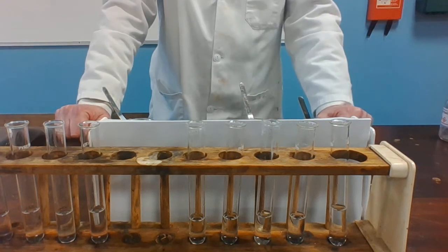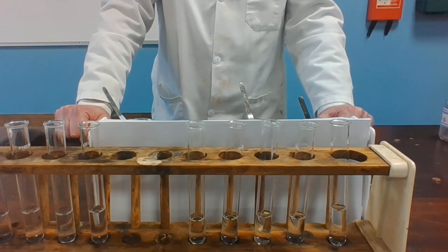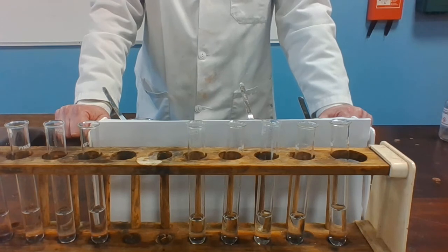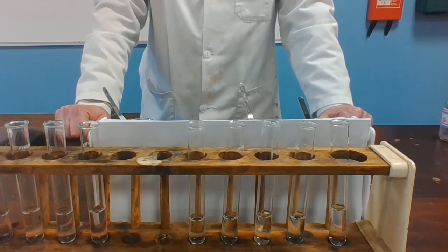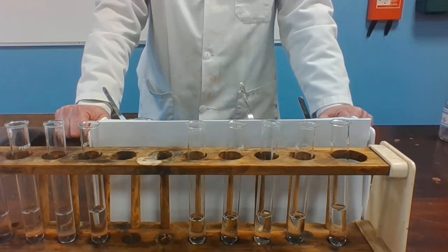This demonstration is to be used in conjunction with the sheet on the reactivity series. The experiment is to establish the reactivity series of metals. The reactivity series of metals can be established by studying the reactions of metals with water and acids, as well as simple displacement reactions. A more reactive metal will displace a less reactive metal from a solution containing one of its salts.